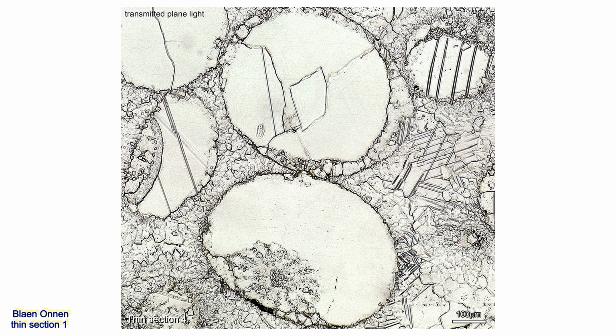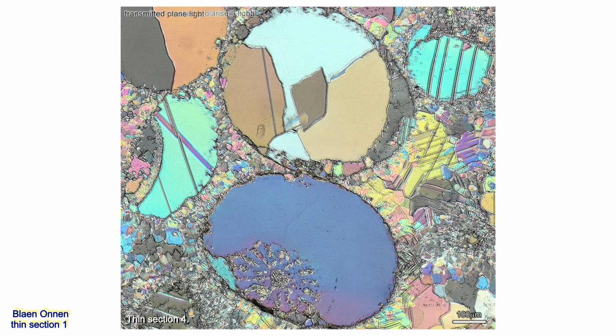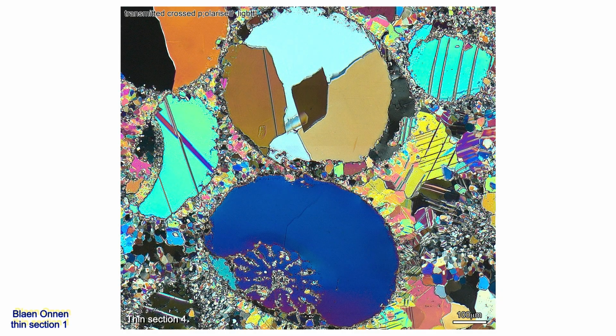The first cement to precipitate in its oomold did so mostly against its right side. The leading edge of this cement cuts smoothly across several crystals and is interpreted as a dissolution surface. Under cross-polars, the stereome of the echinoderm spine in the lower oocast has the same dark blue birefringence color as the surrounding cement crystal, indicating the cement crystal seeded on the echinoderm stereome.